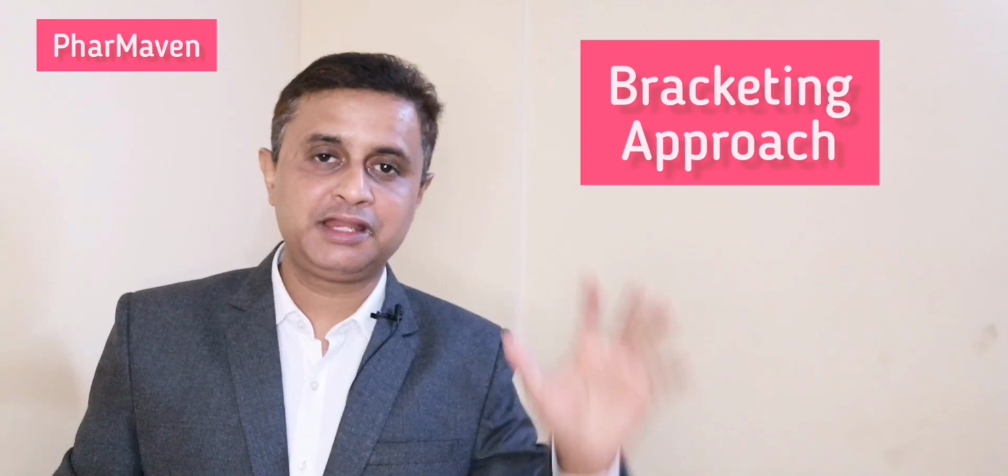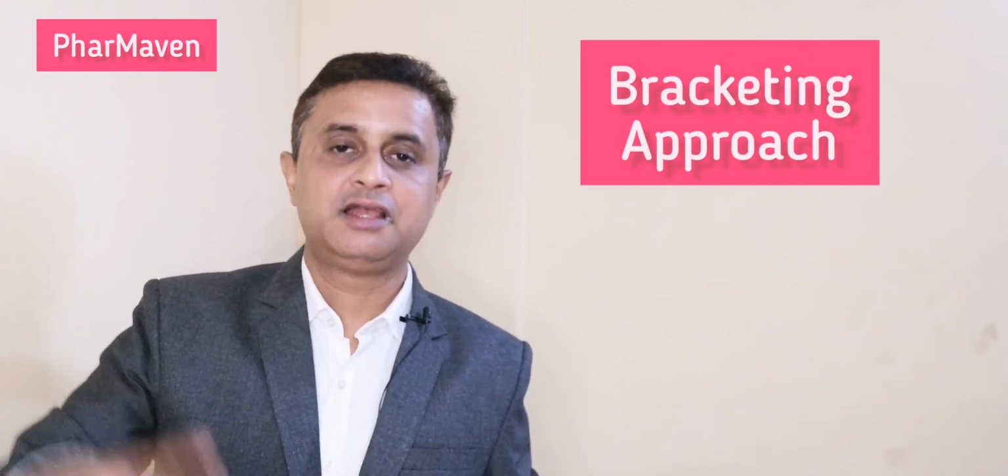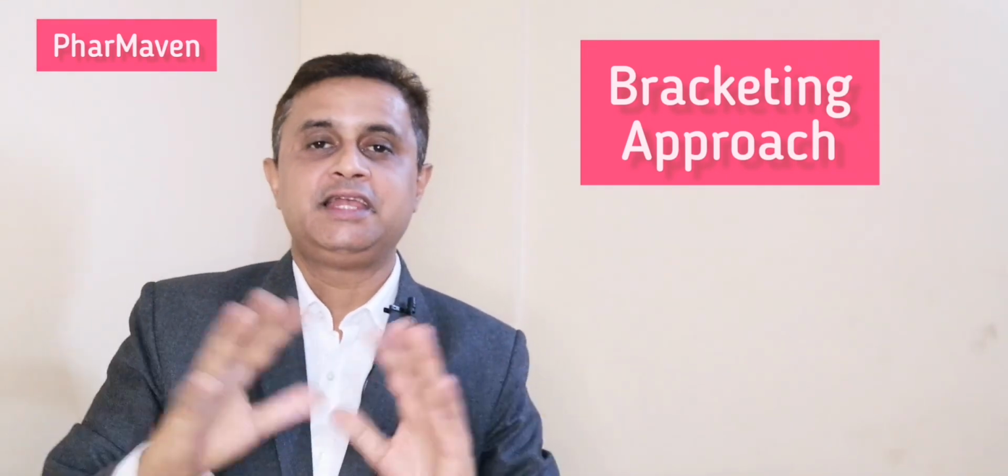We have to qualify the minimum load and the maximum load pattern, and for the routine, in between, we can place the items which fall between my minimum and maximum bracket. This is how it defines the load pattern arrangement.